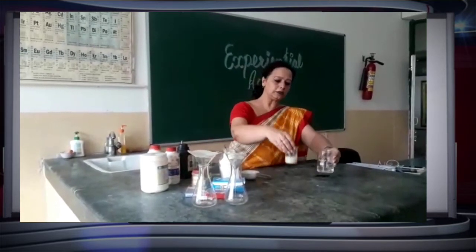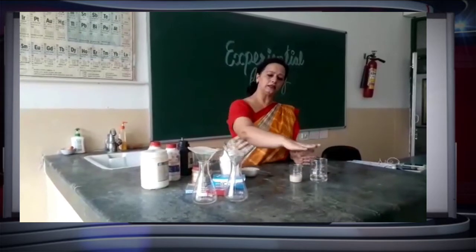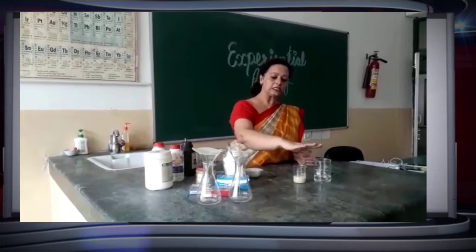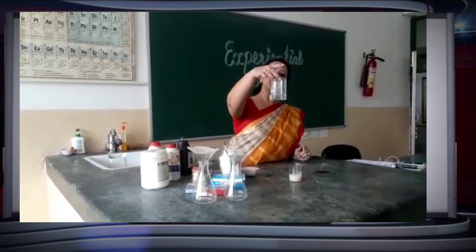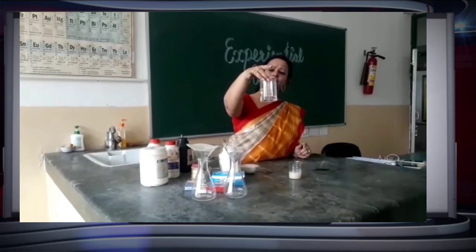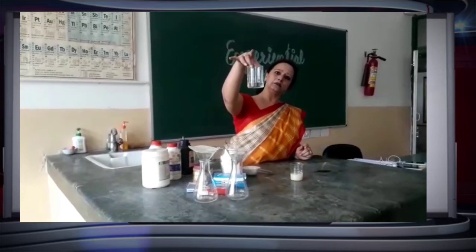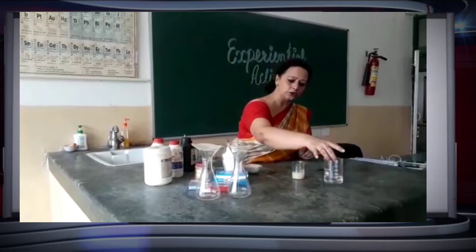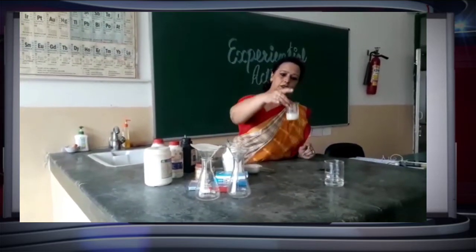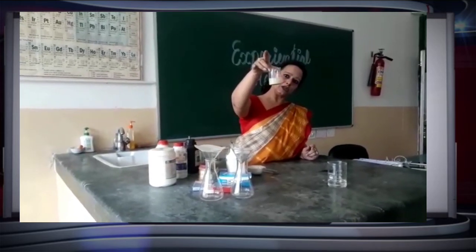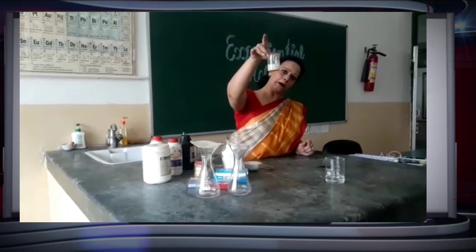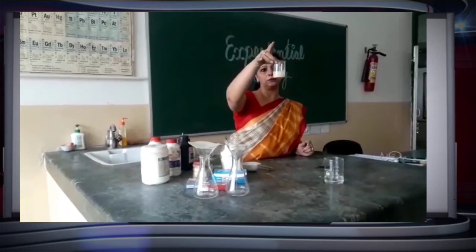Now let us study our third property, that is stability. We have these two solutions: true solution and suspension in two different beakers. I have not touched this true solution for the last 10–15 minutes and we can see it remains in the same condition — so this is a stable solution. Now in the case of suspension, you can see that the chalk powder, that is calcium carbonate, has settled at the bottom. So in chemistry, we call suspension an unstable solution.